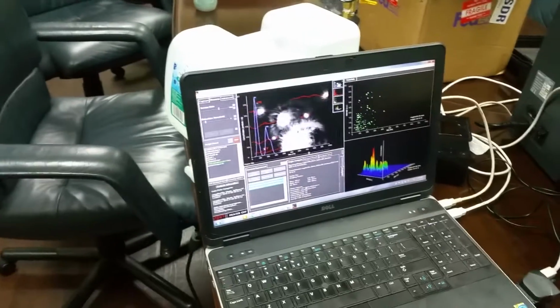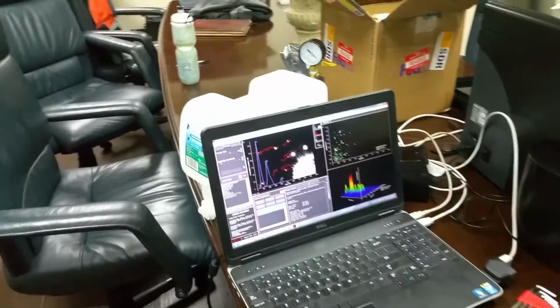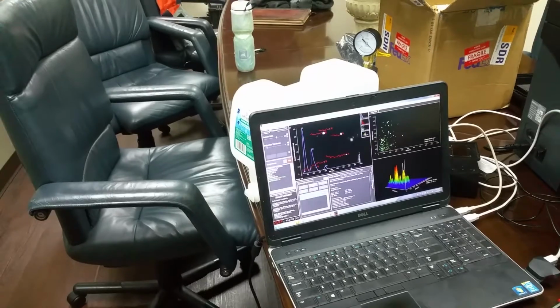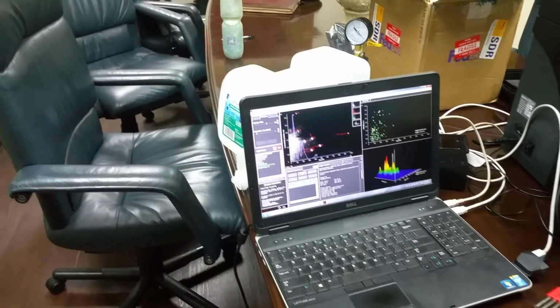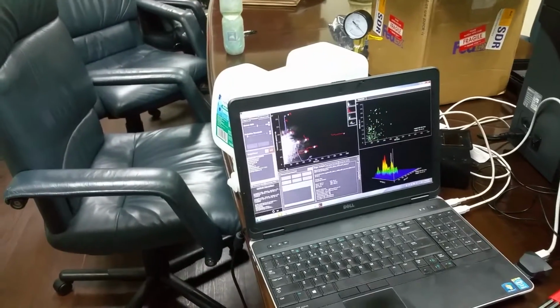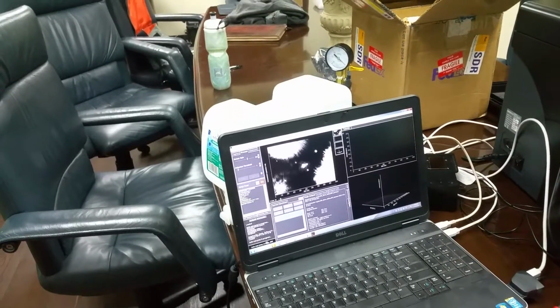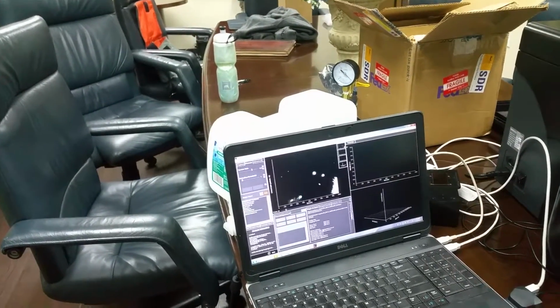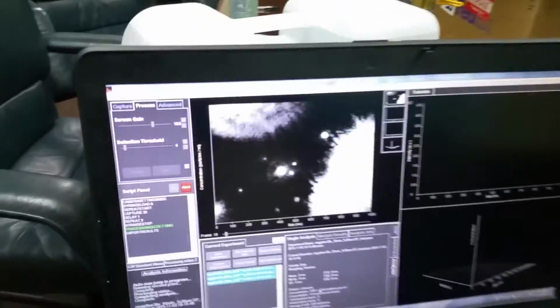At first, we're looking at the energetic response from the nanobubble when you hit it with a laser. That's a characteristic that you see with a particle or a cell or something like that. Right now, we can't make a claim what that response energy possibly is. But when you look at some of the particles, they have a very distinct halo around them.